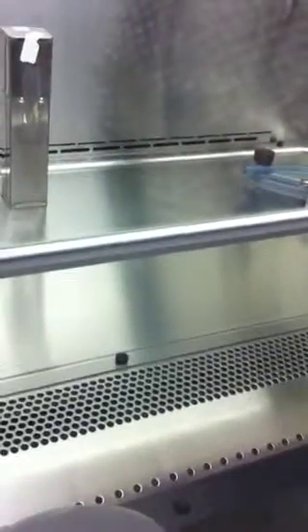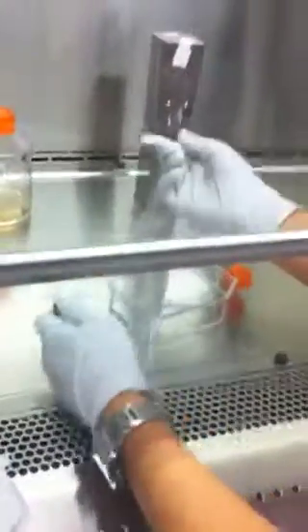Okay. So now the surface is clean. I'm going to take a new flask. Since I'm waiting anyway, I'm taking a new flask. That's what it's going to split into. We have a marker that's sterile inside here. So what made it sterile? That you only opened it up in there from the beginning? Yeah, open it in there. Also wipe them with alcohol at the start.